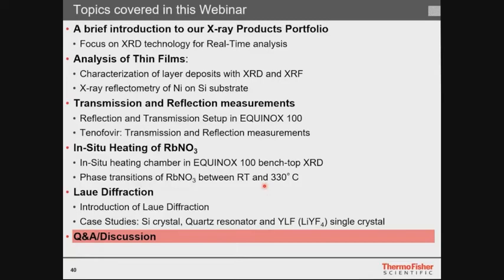But then you can try to measure them as is, but sometimes this will yield not that nice diffraction patterns. But then you have to live with them because there is no solution. You also have to be careful with ball milling, because upon ball milling you apply a lot of heat and pressure, and you could change the sample. So it really depends on the sample, and you have to be careful.